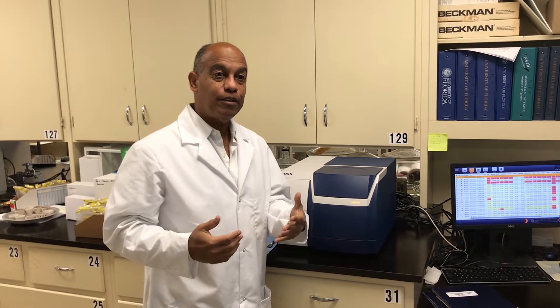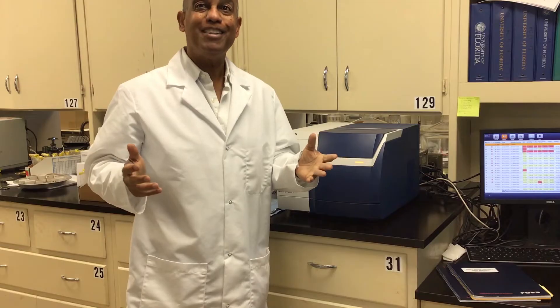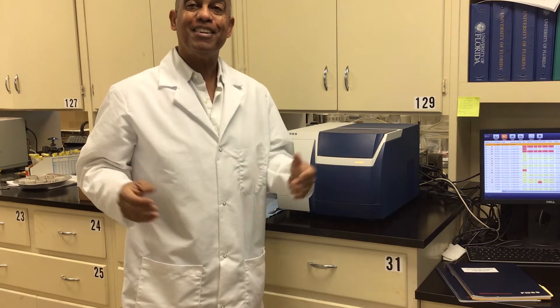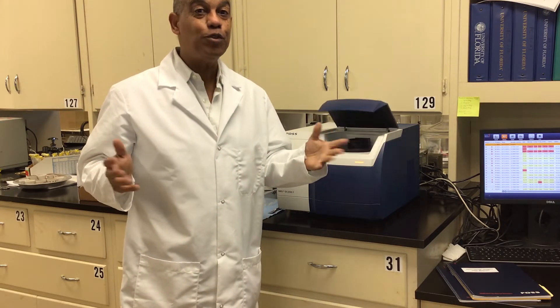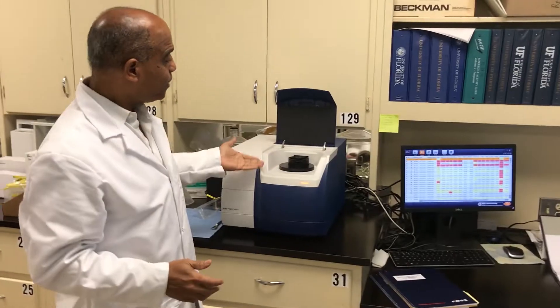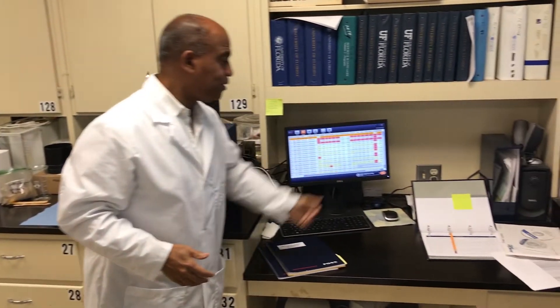This is probably the future of lab work — it's just like computers, the faster the better, and it's never fast enough. Currently we're doing about 30 different analyses which would take a lot of time otherwise. And — boom — it's ready, it pops up, and we have all the results. We're done.